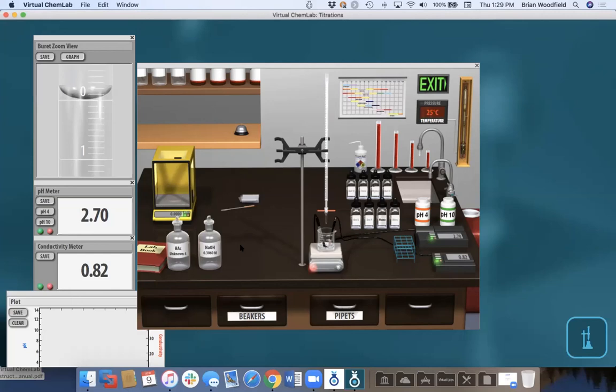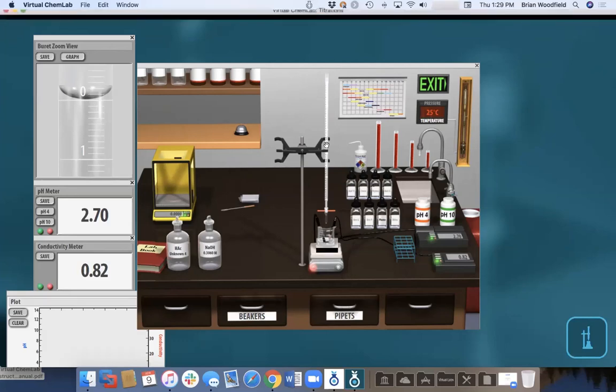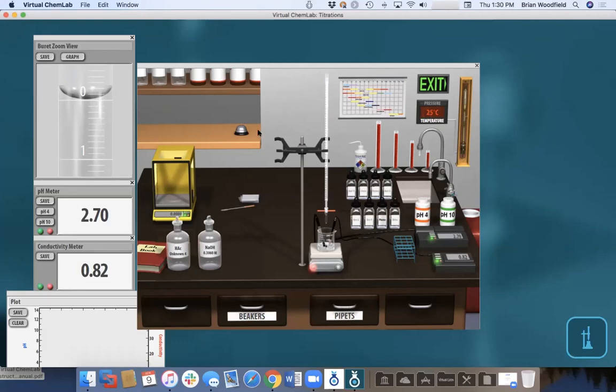And so I was trying to get to the 10th percent accuracy. The other things that we added in here, for example, is this burette is not a true volume. We have in a random glassware error associated with this burette. So it doesn't produce the exact volume.